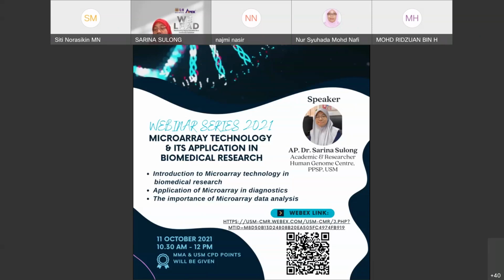That is also from the manufacturer, from our database. Another question also from Shazana. I guess Shazana is the one who really wants to work with microarray analysis next time. So, how do we differentiate the non-specific binding in the microarray data? I'm not really sure about the non-specific binding. Are you referring to the hybridization process, where the fluorescence cannot bind to our DNA samples?